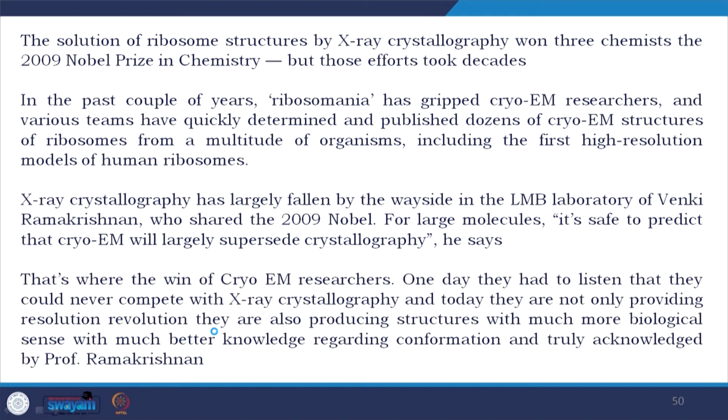One day they had to listen that they could never compete with or supersede X-ray crystallography, that they would be a niche. Today they are not only providing the resolution revolution at the level of X-ray crystallography, they are also producing structures with much more biological sense, with much better knowledge regarding conformation, activity, and connection to biology.